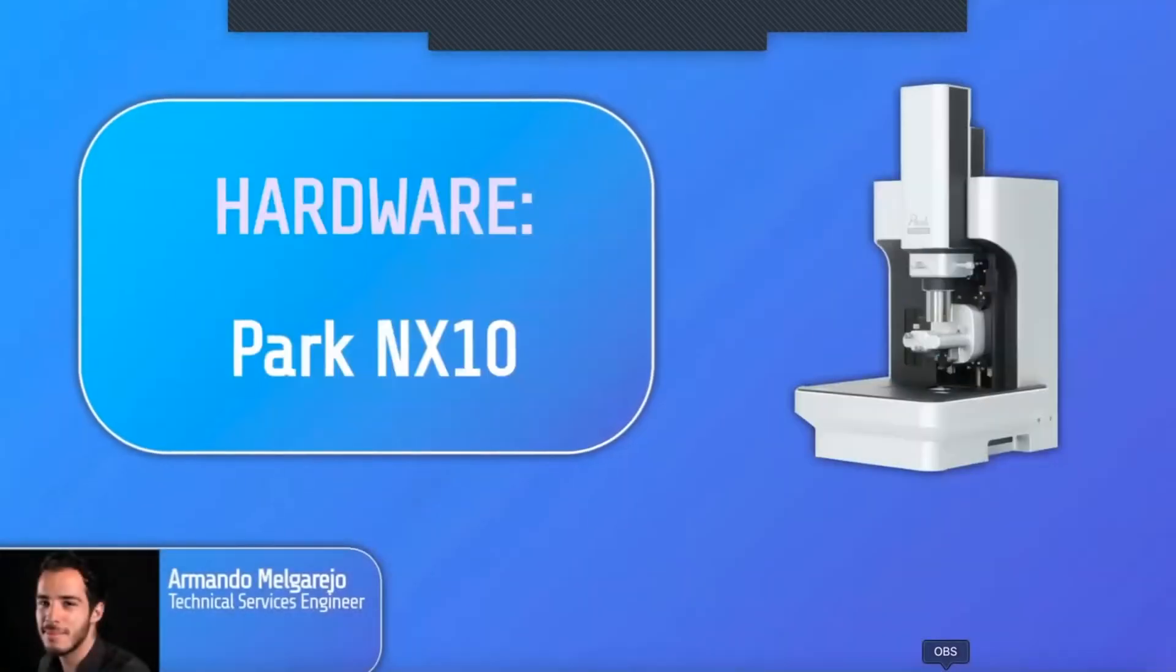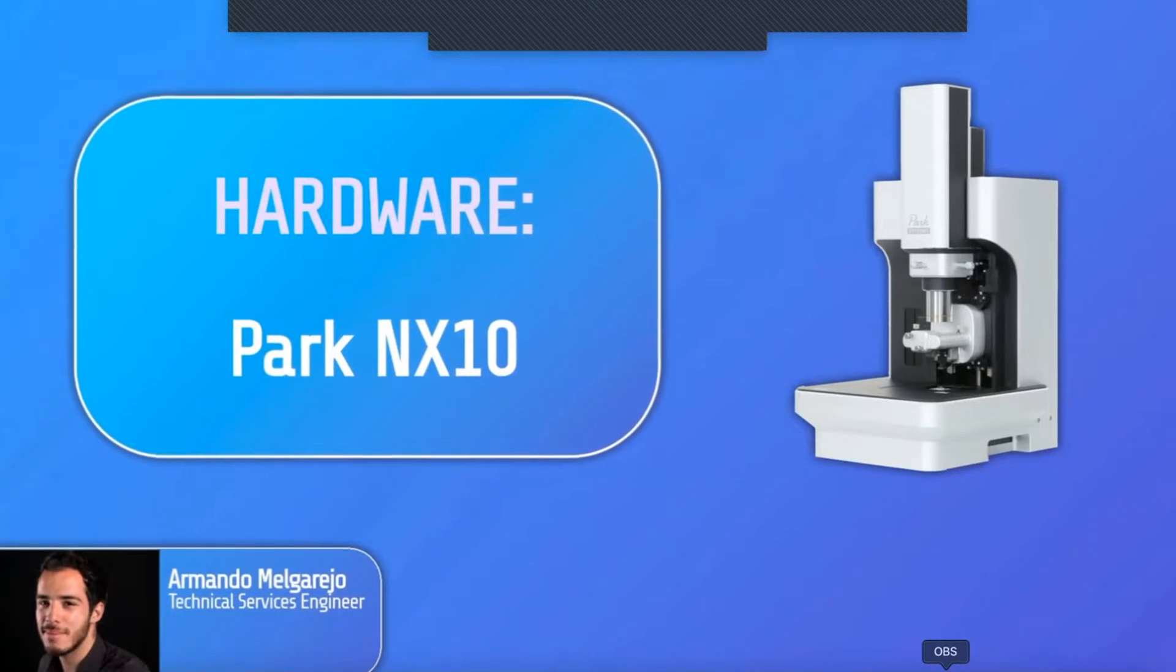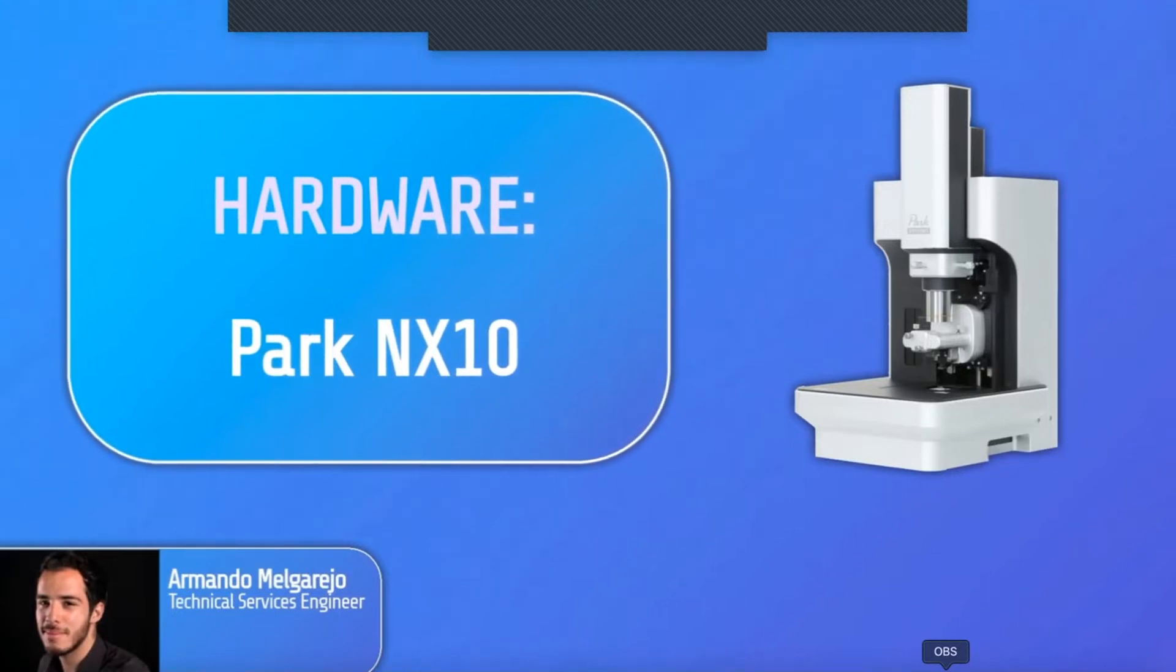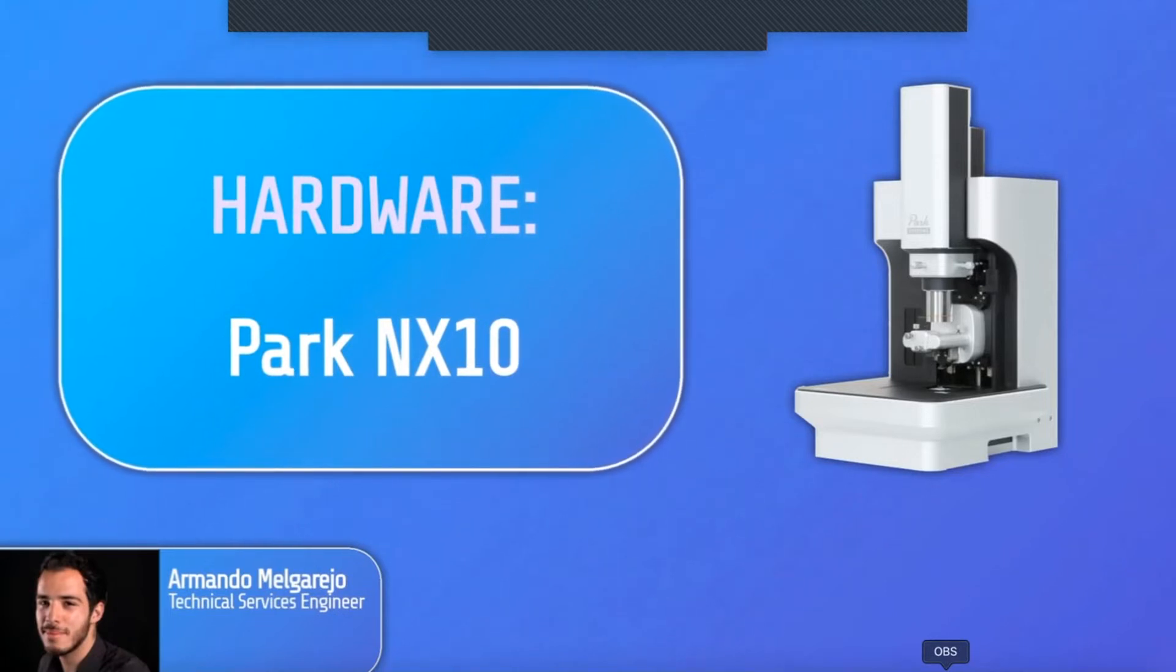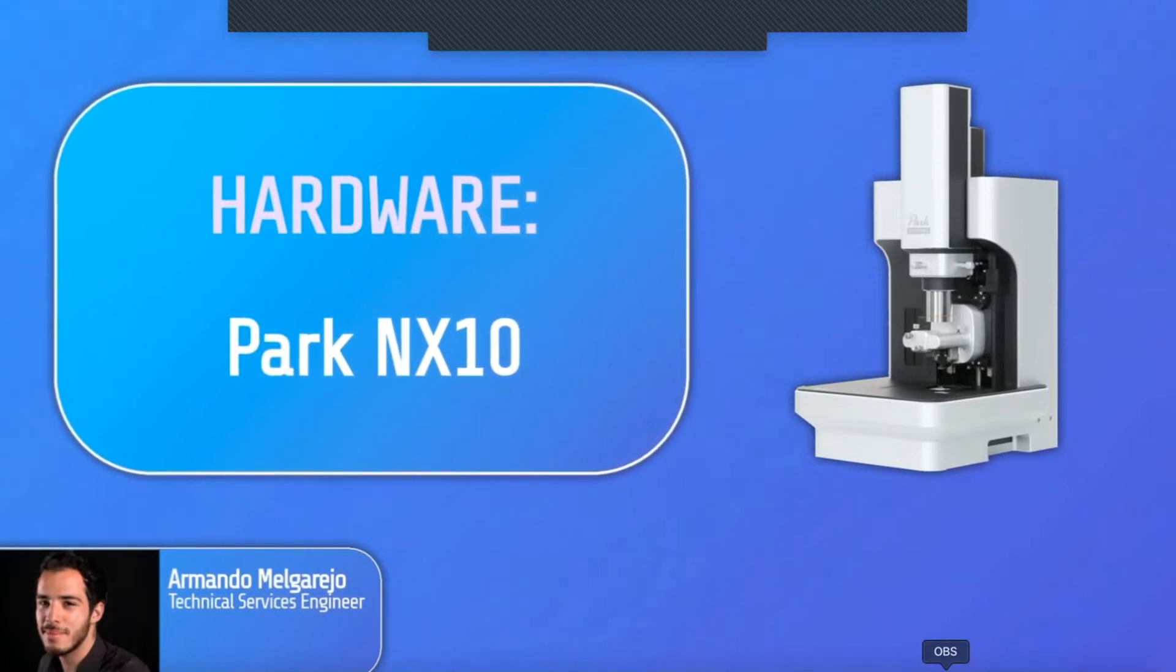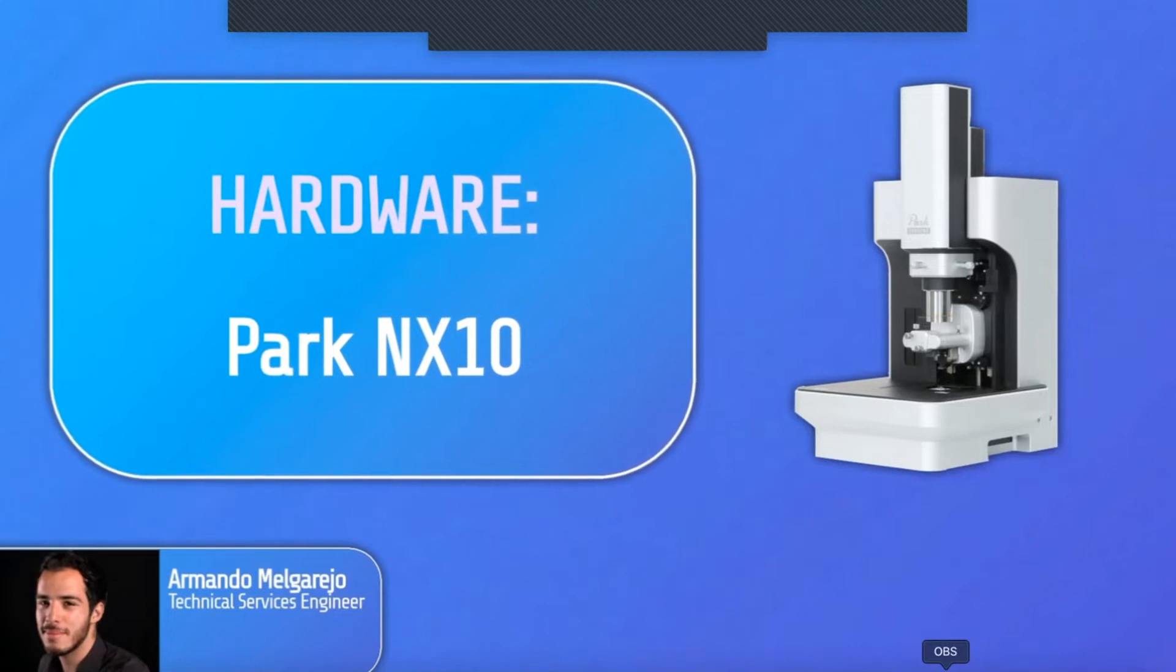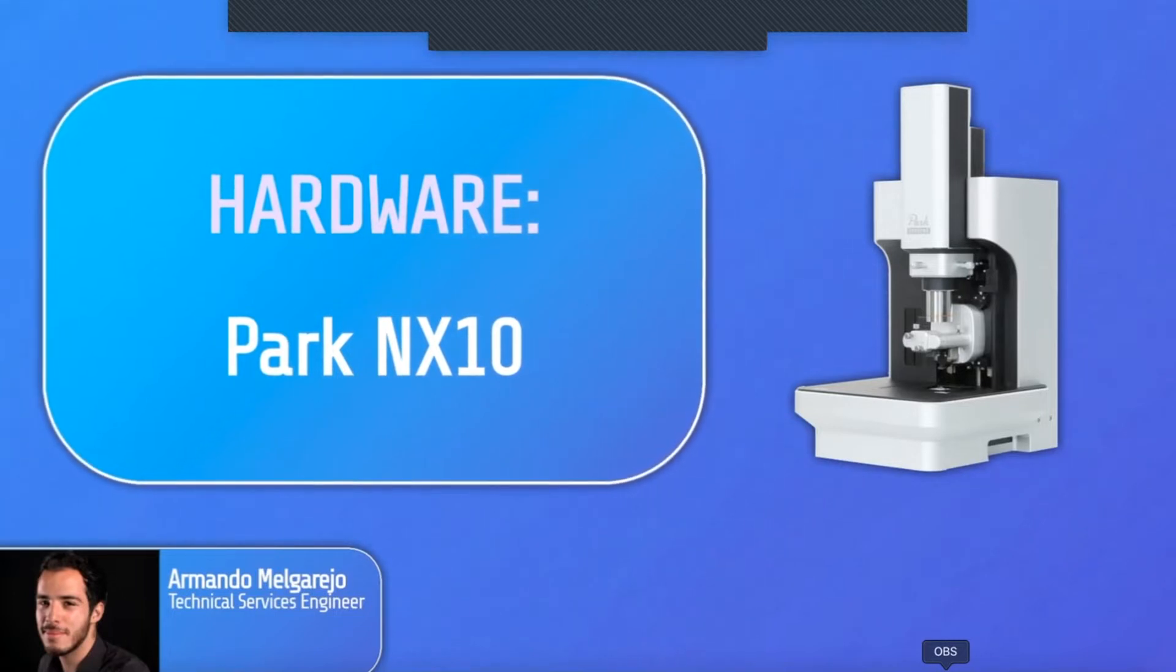For this demonstration, I'll use the Park NX-10 AFM system. The NX-10 can accurately render high-resolution data due to its advanced decoupled three-dimensional scanner. The XY scanner moves laterally, while the Z scanner moves vertically.